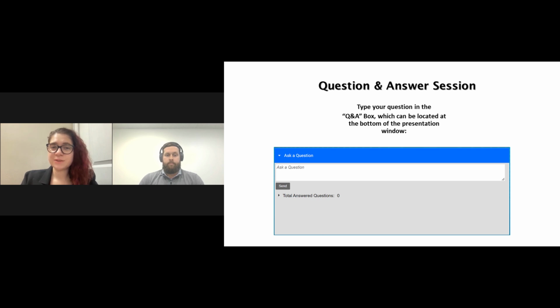Great, thank you. Our next question says, in the case of running toxic compounds, does the exhaust have an option to add carbon or other filters so gas does not go into the room, or would this perturb the flow controls due to the back pressure? Okay, yeah, that's a great question.